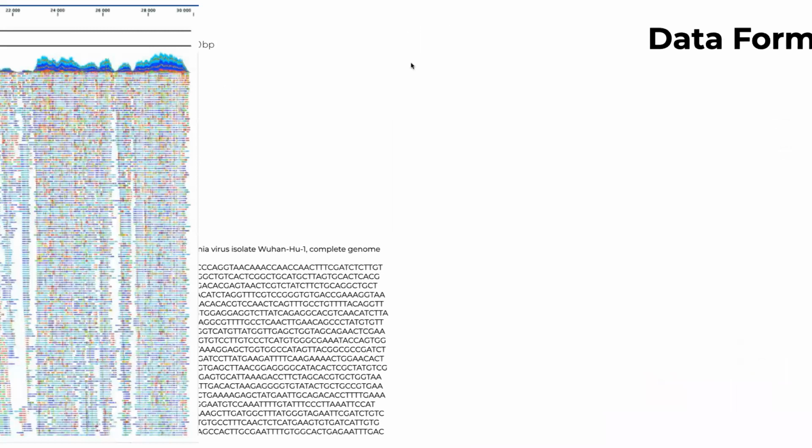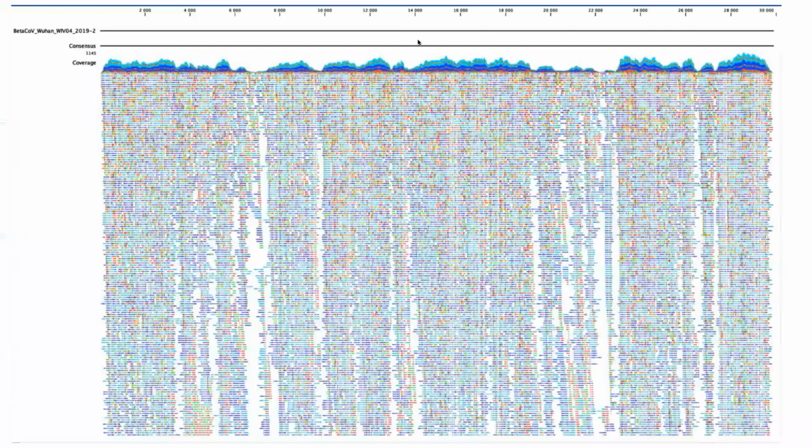The abundance of read mapping on a particular position in your genome, or you can think of this as a whole series of genomes, could be measured as depth of sequencing, which means that you have reliability of that particular position, or even variation in that position, depending on what kind of sequencing is done. Later on, this could also be annotated based on whatever you have in your reference genome.